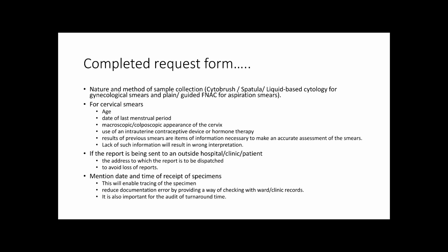Right? When we consider the nature and the method of sample collection, it should also be mentioned in the request form, right? Whether it is cytobrushing or spatula or liquid based cytology for the gynecological sample, and plain or guided FNAC for the aspiration smear.